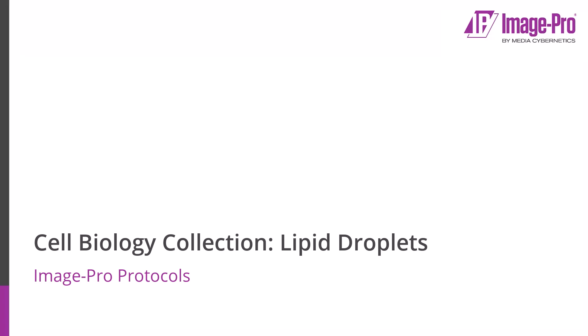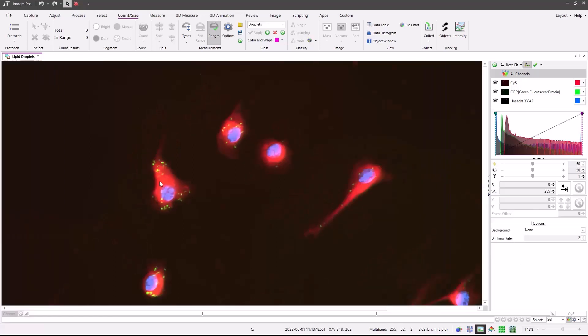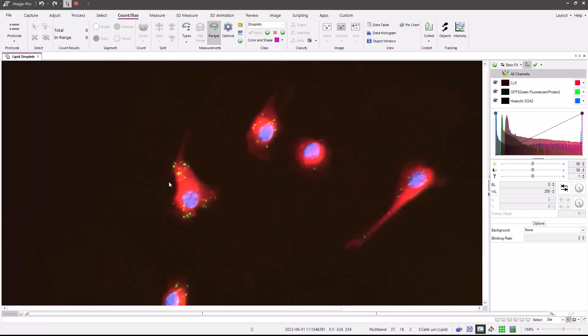In this short video, I'm going to discuss the lipid droplets protocol, which is part of the cell biology protocol collection. The protocol is designed to measure the proportion of fluorescently labeled cells that contain three or more fluorescently labeled lipid droplets such as these.